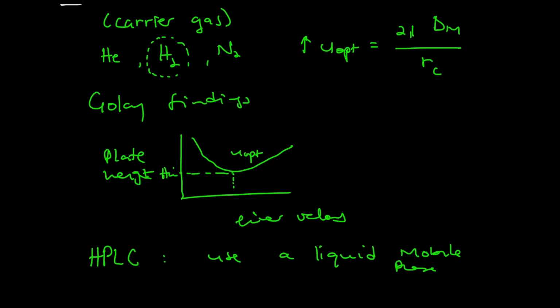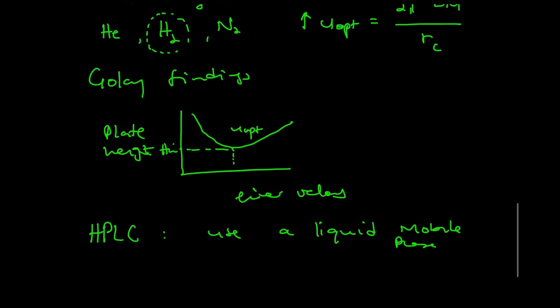Due to these differences, the gaseous mobile phase and the liquid mobile phase, this will have a major impact on how we design the HPLC column. Okay, cool. Let's go further.